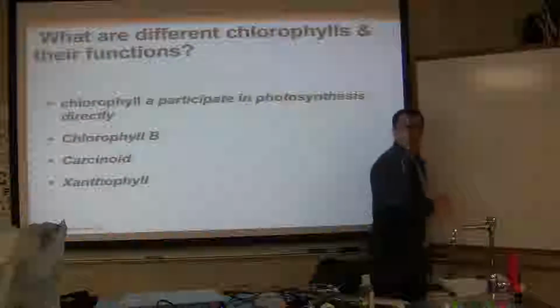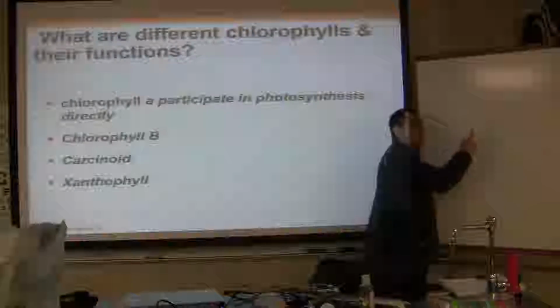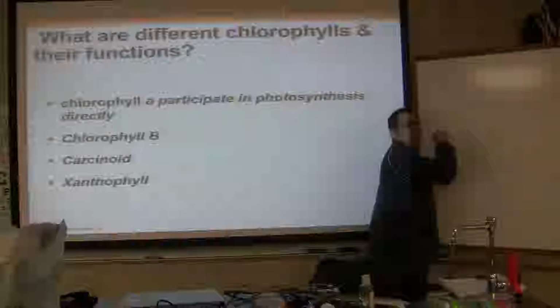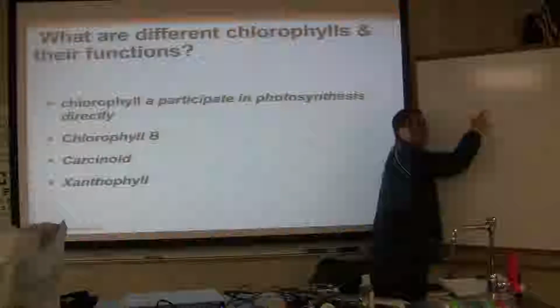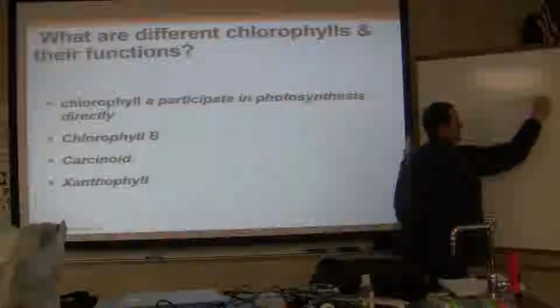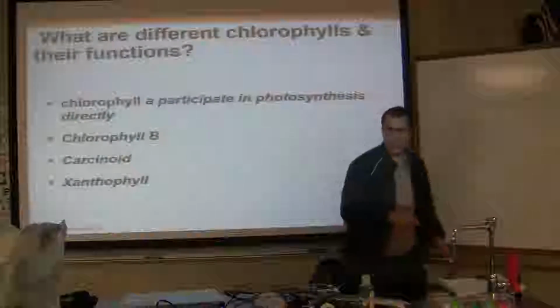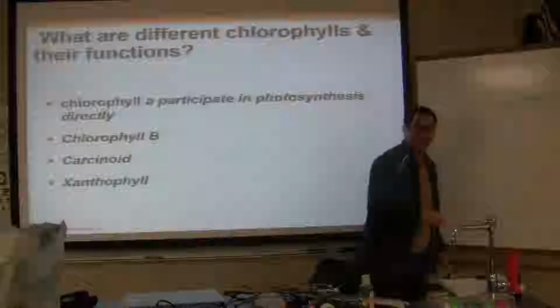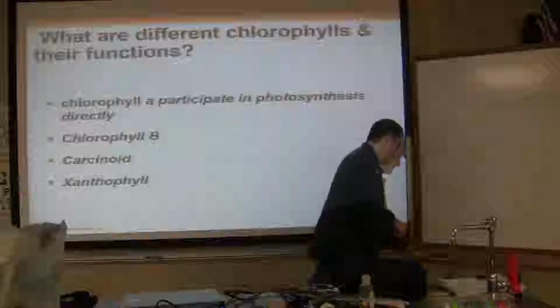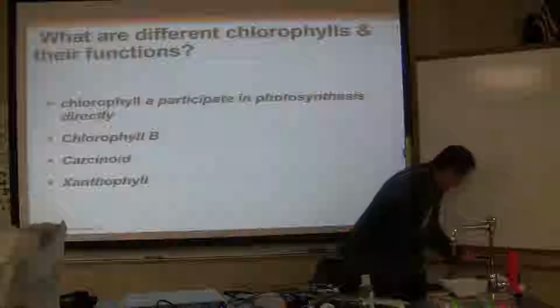B. Chlorophyll B did not travel far, so it's the heaviest one. Which one is the lightest one? Xanthophyll. Okay? Xanthophyll was the lightest one. Am I making some sense? Everybody, how things go? And this is what you did last time on Wednesday.